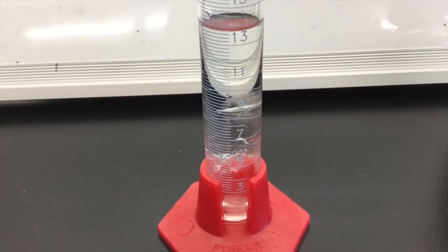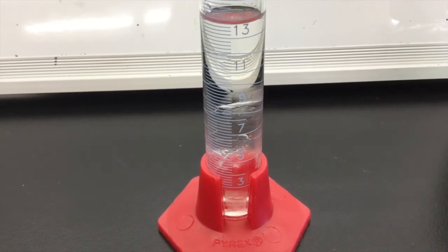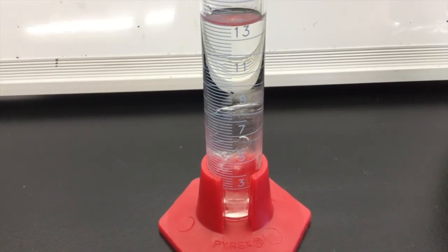Notice that the ice has sunk to the bottom of the graduated cylinder. What does this tell you about the density of the ice relative to the density of hexanes?